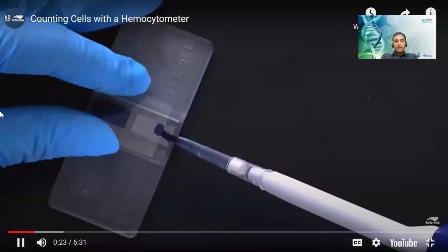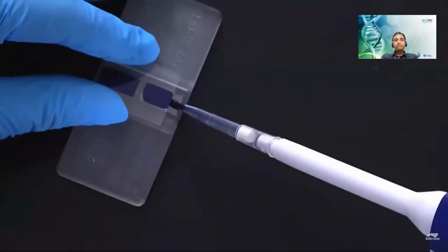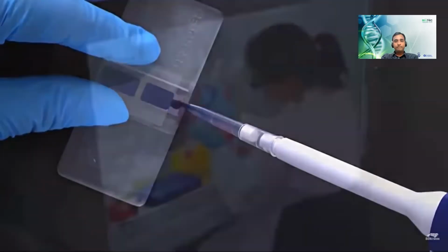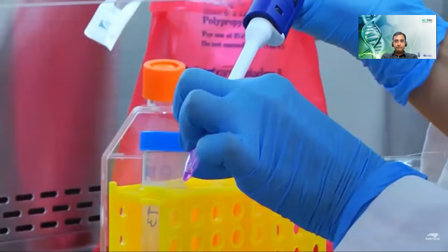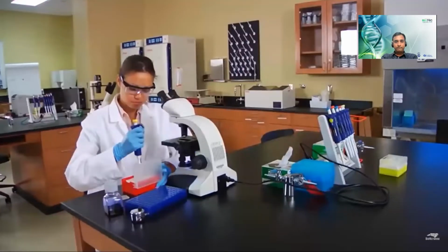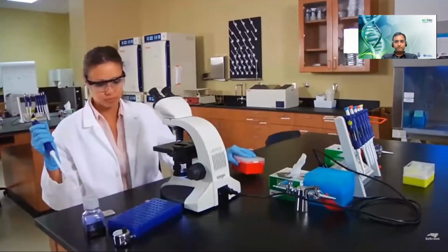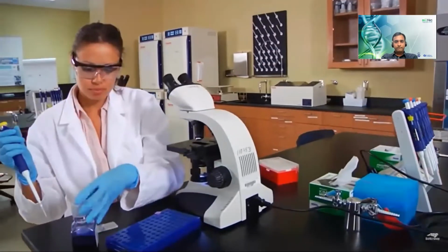A simplified microscope slide containing 2 identical wells or chambers into which a small volume of cell suspension is pipetted. We have already removed 100 microliters of our cell suspension and placed it in a microcentrifuge tube. Dilute the suspension by adding 100 microliters of trypan blue.